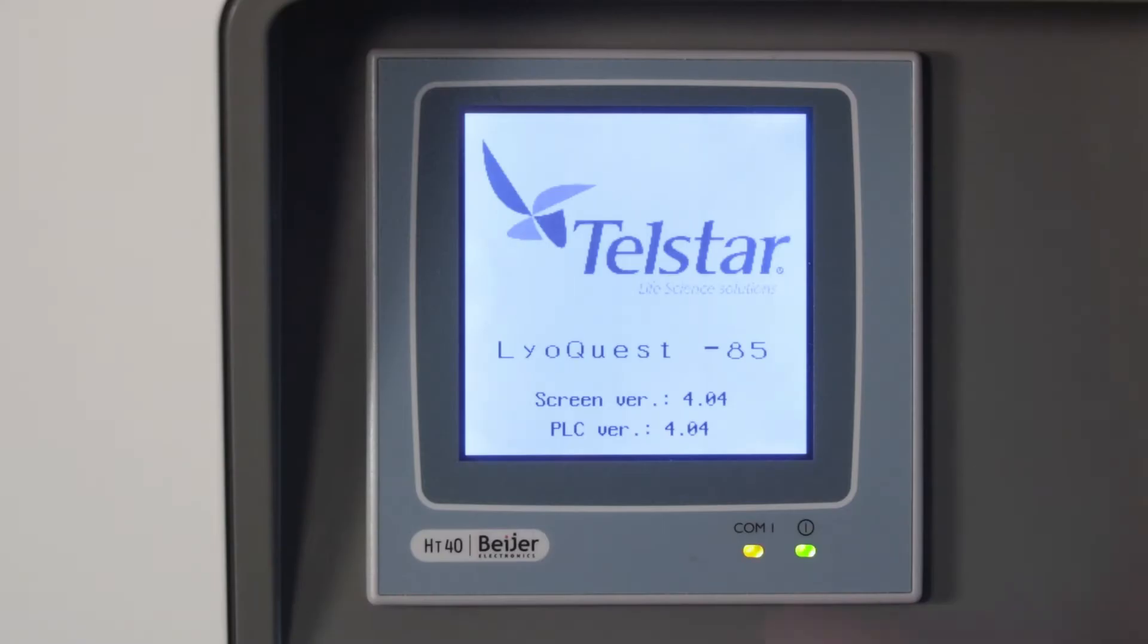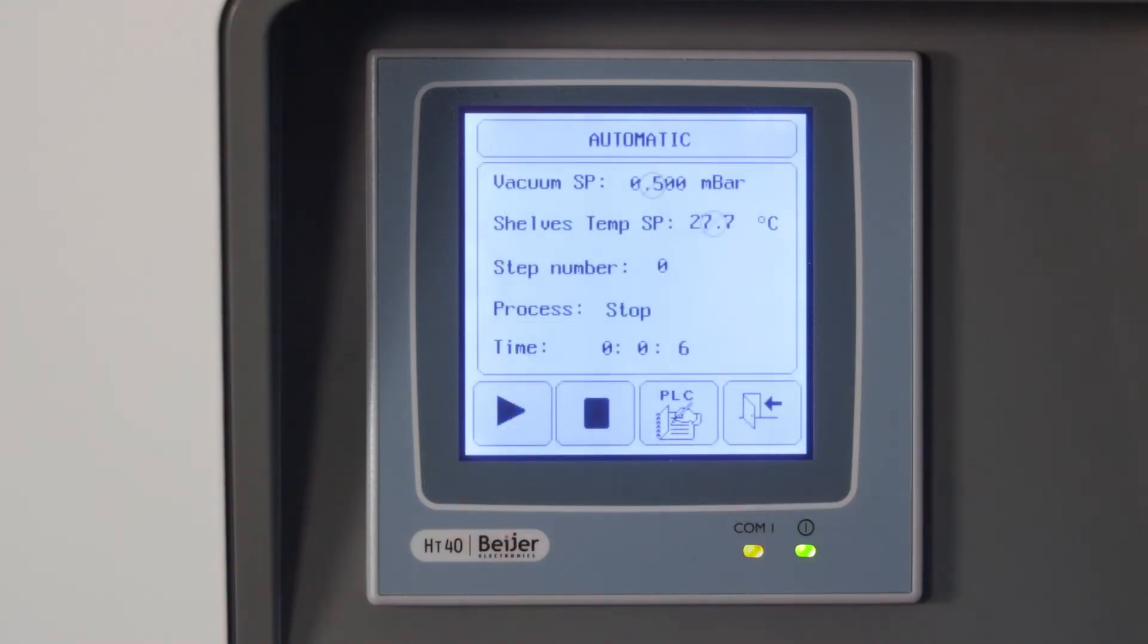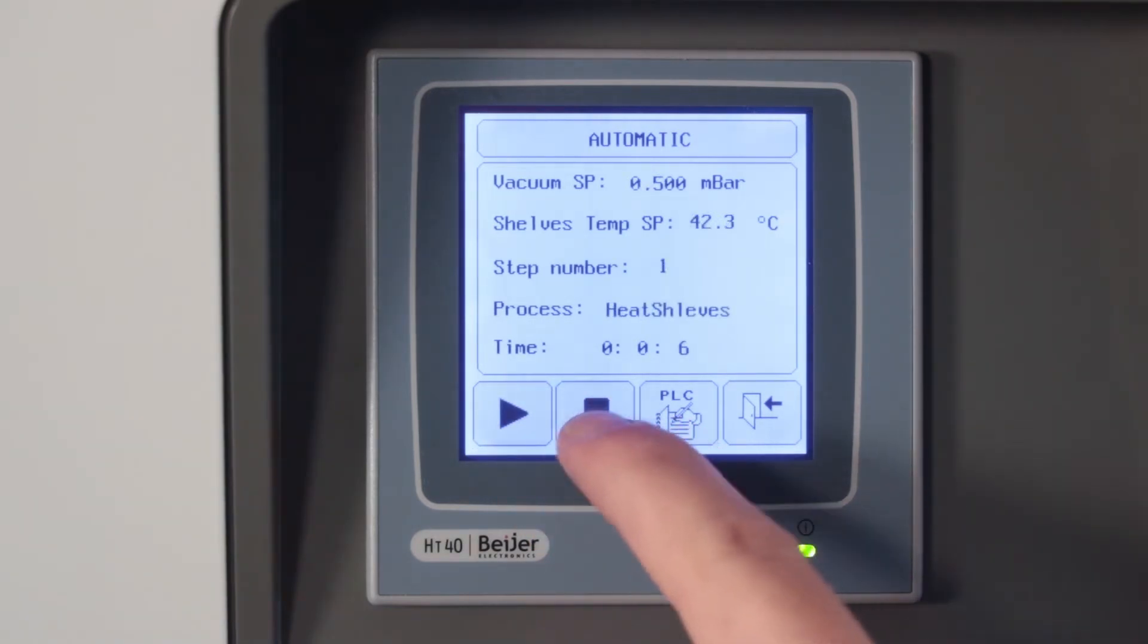This is the introduction screen. Press to access the main screen. The main screen includes four buttons from left to right. In this mode, you can start the automatic mode and stop manually.